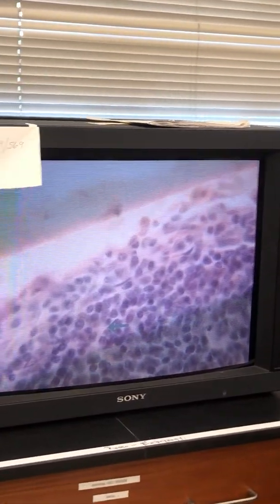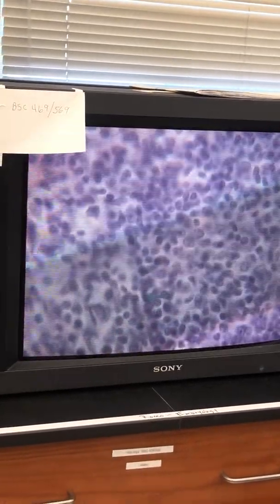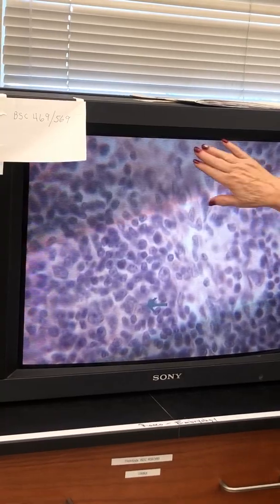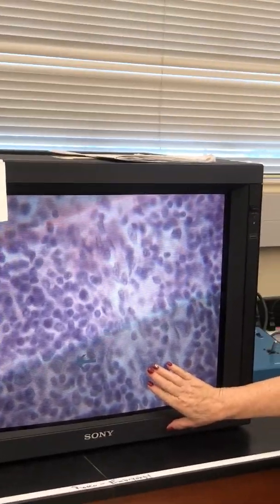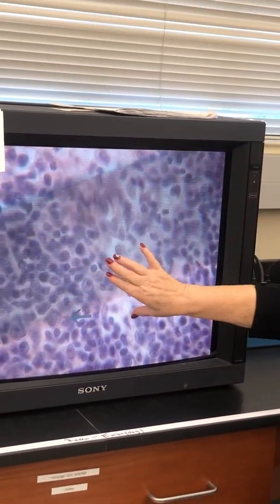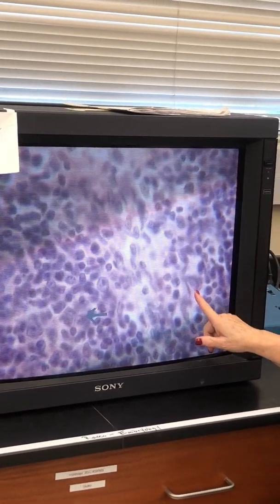Now let me find, if I can find over here, yeah I can. If I go here, we know that this is connective tissue, and that's your trabecula, right? And on the edge of it, you would have a trabecular sinus. It's not as cellular as the other. And you see this elongated cell?